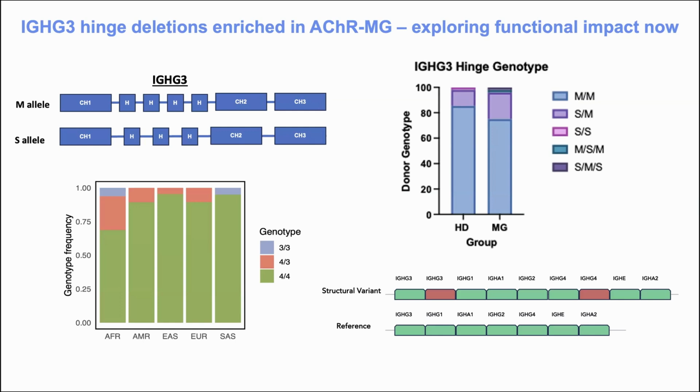we've been working on these assays for over 10 years now, as I mentioned. My collaborators and I really started to see the potential of these, and we wanted to be able to offer them to everyone else. We think that when you think about effectiveness of drugs, a lot of the focus is on the formulation. Did we add the right adjuvant? Did we target the right immunogen? And very little attention is paid to how different host immune systems may be influencing that activity.